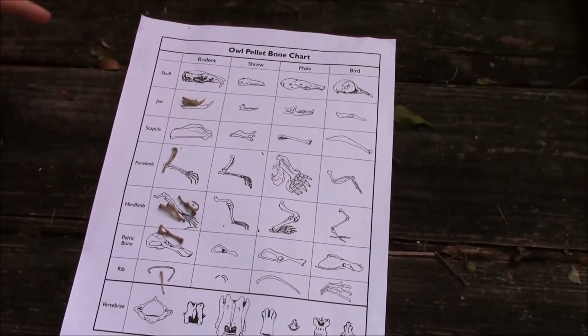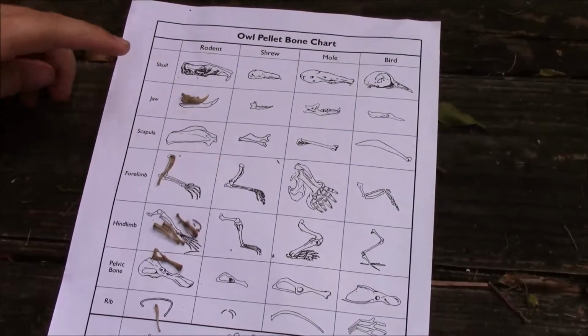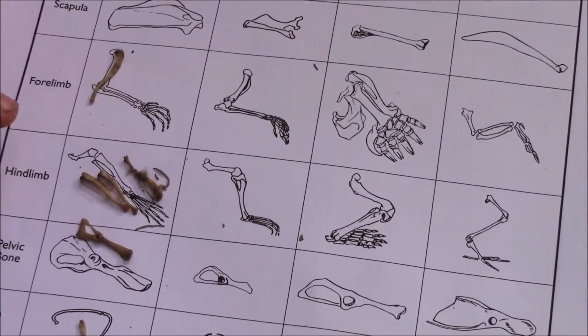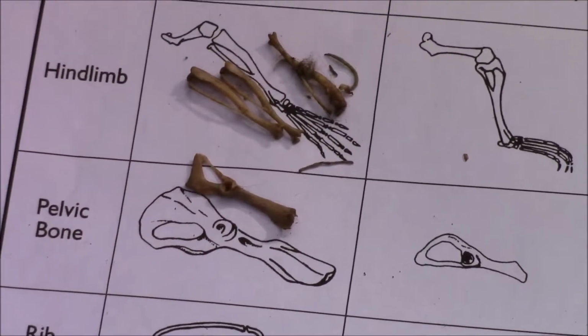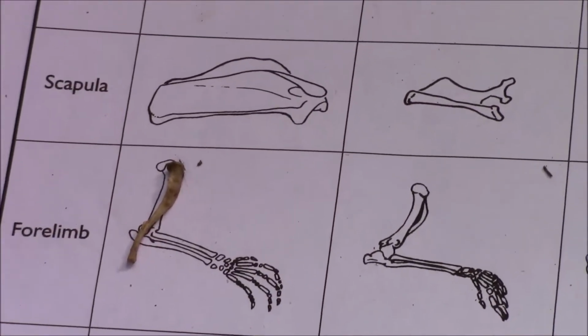These are some of the bones Grant's pulled out of the owl pellet. We've determined this is a rodent. So far we found a jaw, a forelimb, hind limb, pelvic bone, and possibly a rib bone. So digging around owl pellets is one of our favorite activities to do around our house. It should be fun for you guys.